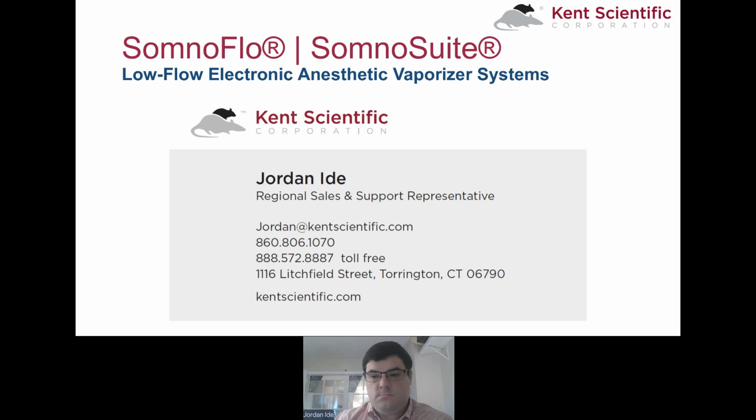Okay, I think this may be the last question, so let's address this one. If you're using the Somno flow under a ventilated procedure hood with the ambient air intake, will the ambient air intake be affected by the hood's airflow? So this is a good question. The ambient air intake will not be affected, but the nose cone delivery flow rate will be affected. So what that means is if you have a vacuum, pulling air from the outside, there's a chance that the hood will pull the anesthetic away from the nose cone. So to overcome this, you'll need to use a little higher flow rate.